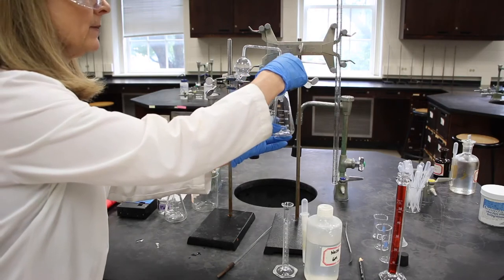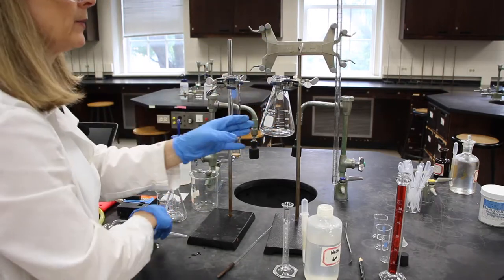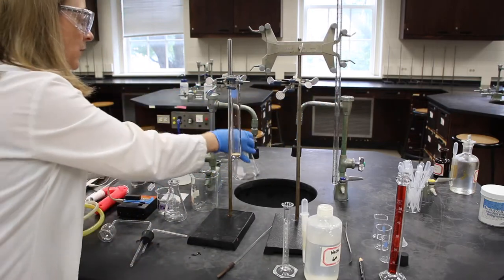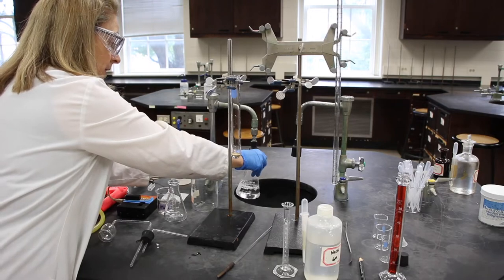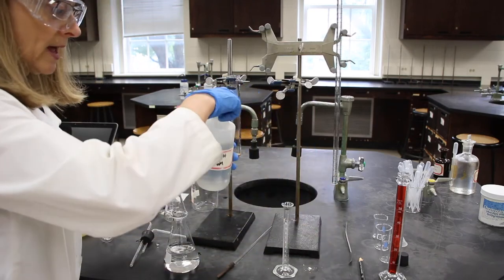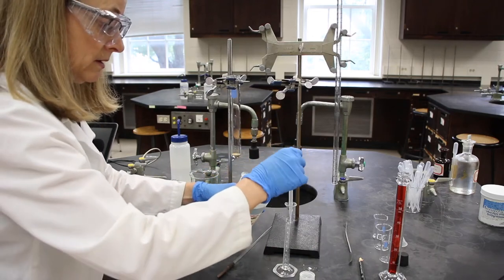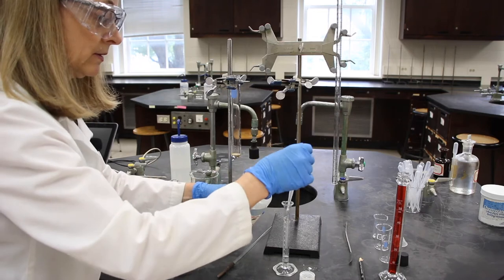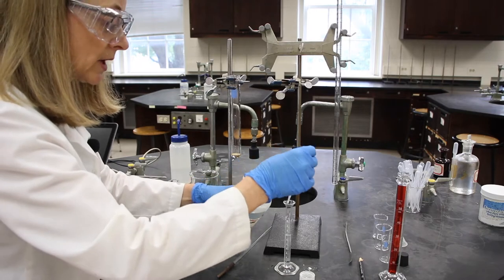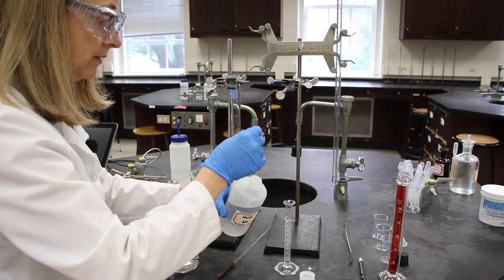Now I need to assemble my gas trap. So I'm going to take off my hood apparatus and I'm going to add about 150 milliliters, the amount is not terribly important, of tap water to our Erlenmeyer flask. And I'll add about 10 milliliters of sodium hydroxide to this Erlenmeyer flask also. The sodium hydroxide will neutralize any toxic gases that are formed.